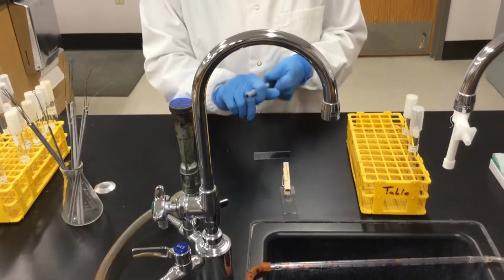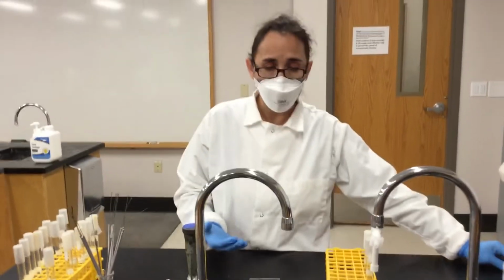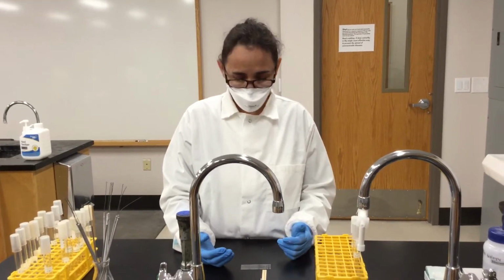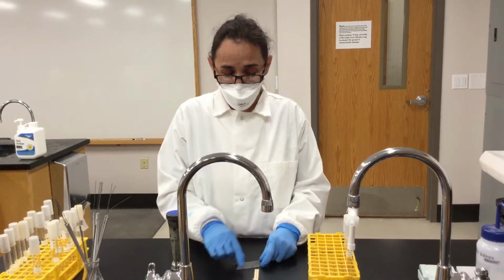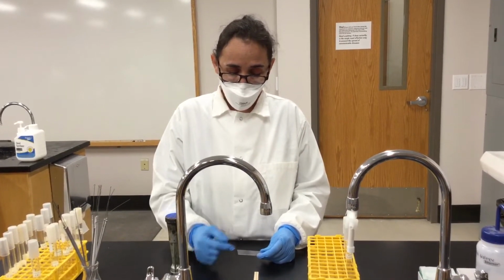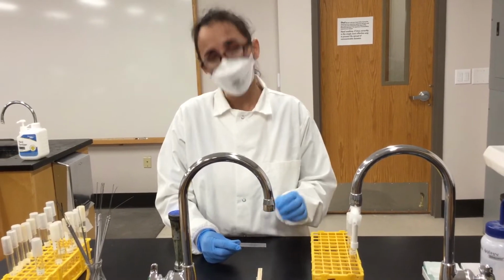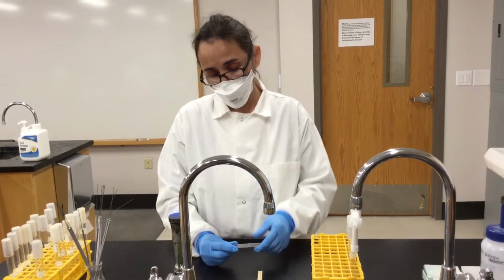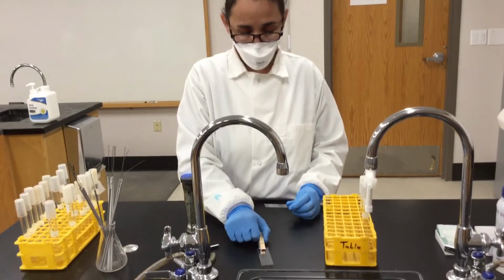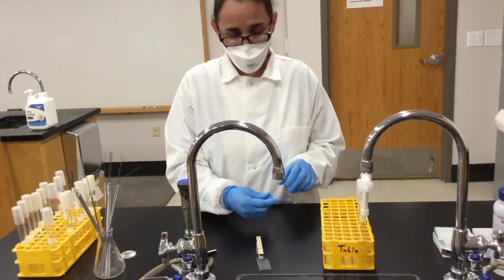Why do you do that? Well, because you're going to be adding some decolorizing agents on top of the smear in some of these staining techniques. If you add this, part of the colorant of the Sharpie will go into the bacteria. So this is almost ready for being dry. And then this is how this looks.